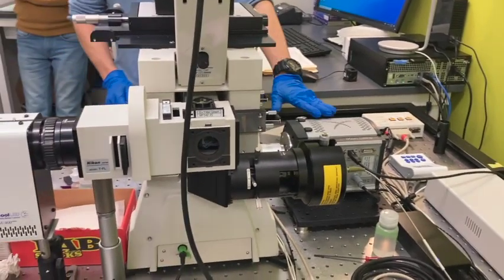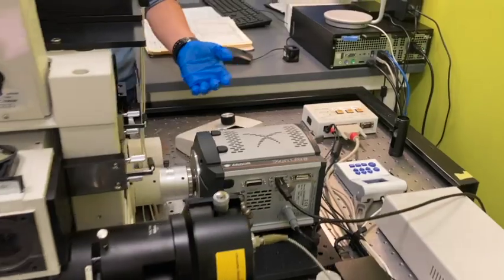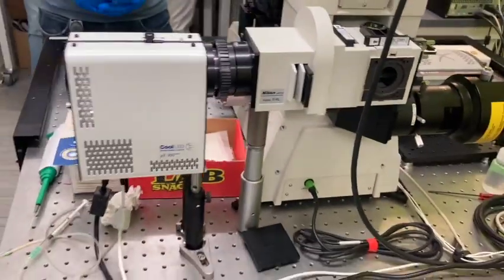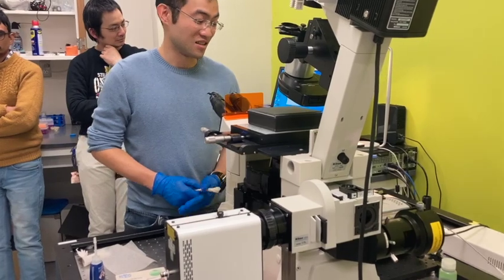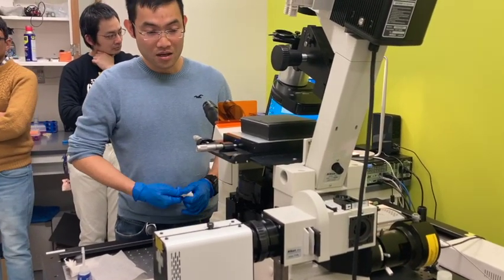I think you really need to pay attention to the camera, because if you leave it powered on for a long time, it's not good. It's also the most expensive of the cameras that we have. The camera is really expensive.